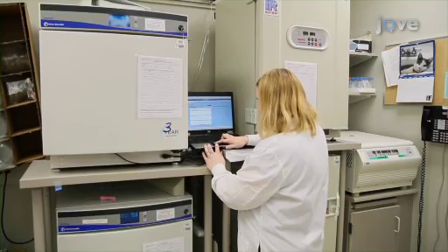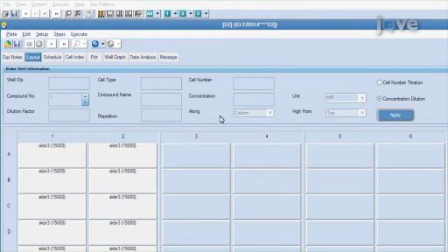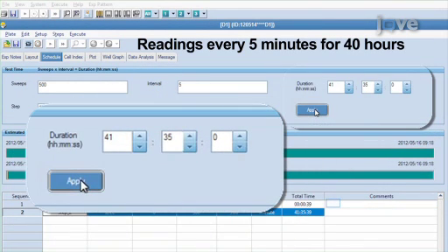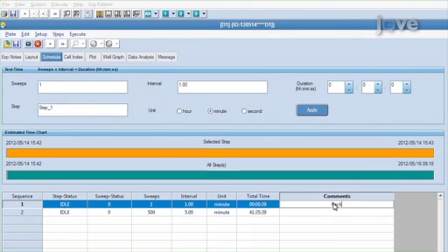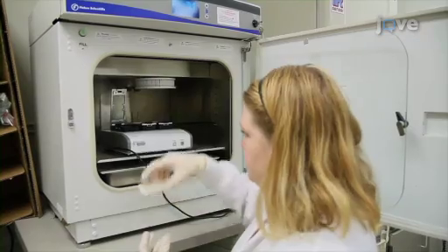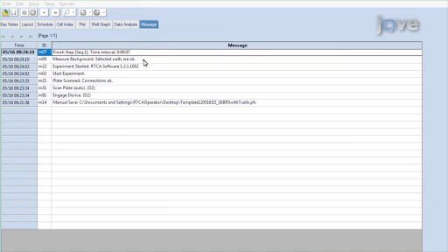Next, program the Excelligence software. Set up the layout page with the well layout. Set up the schedule page to take impedance readings every five minutes for a 40-hour period. For the first 18 hours, the Excelligence system will only take impedance readings of the tumor cells. Then add 100 microliters of RPMI tumor media per well. Take a background reading on the Excelligence E-plates by measuring impedance in the absence of cells.